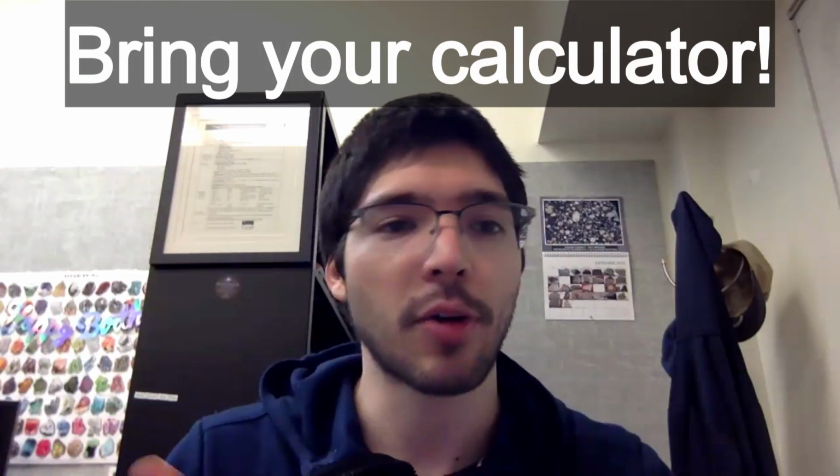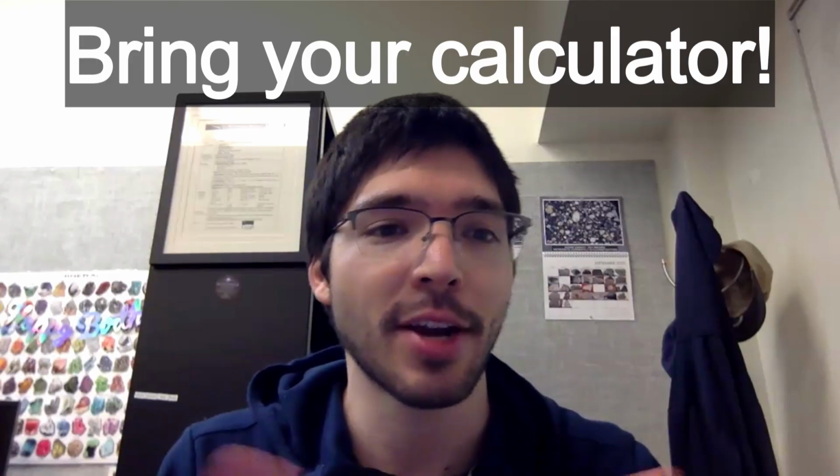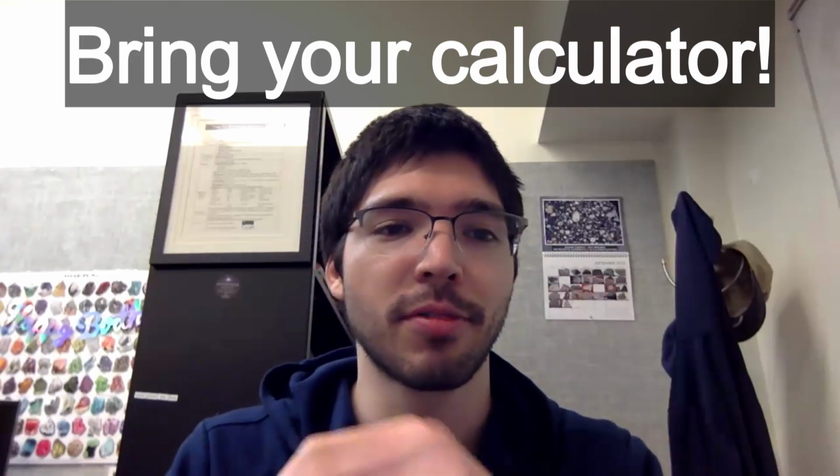So part three is basically me doing that live, though I think the recording is not the best way to do that. I'm basically just going to be going through, processing the data mineral by mineral, making sure they're clean, and then calculating fayalite. We can all do that together, calculating ferrosilite, and then going into the write-up and saying, okay, what meteorite group do we have?